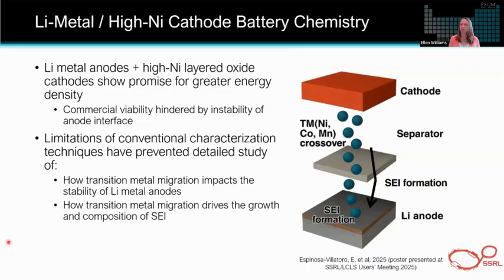A lot of work has been done on this specific chemistry type on the transition metal migration. But what those techniques struggle with is reliably measuring lithium. And so that's where our LALI-TOF-MS technique very well complements all of these capabilities at SSRL.